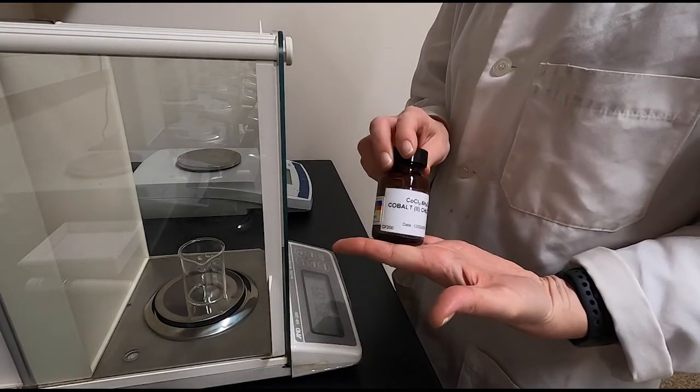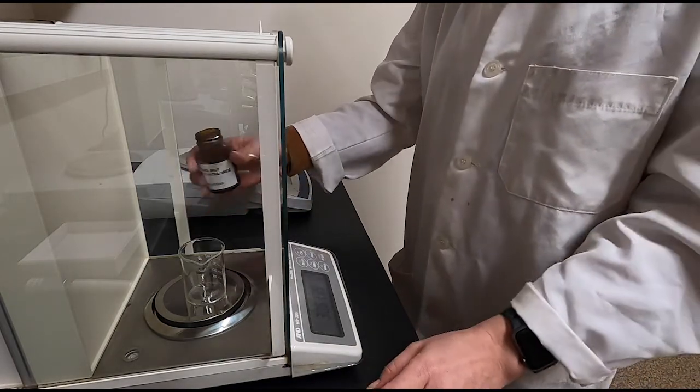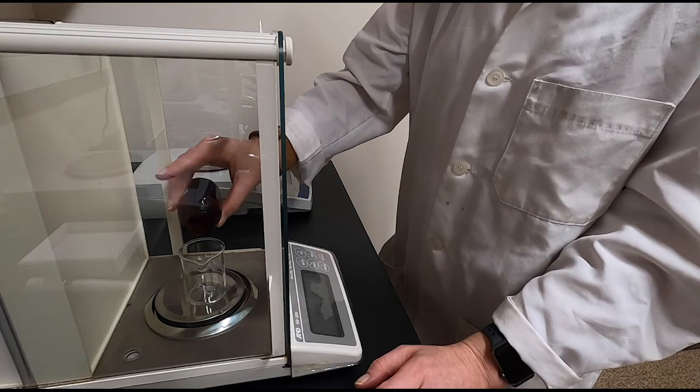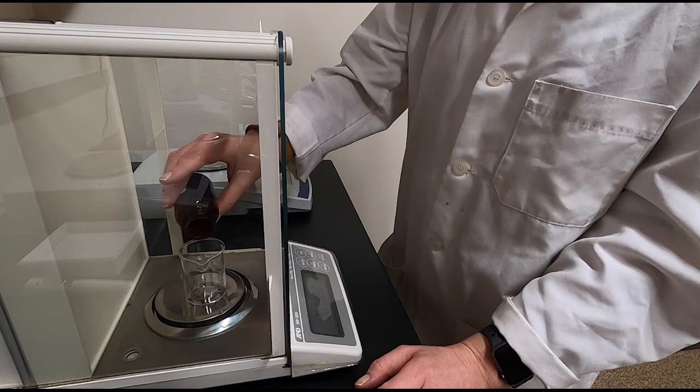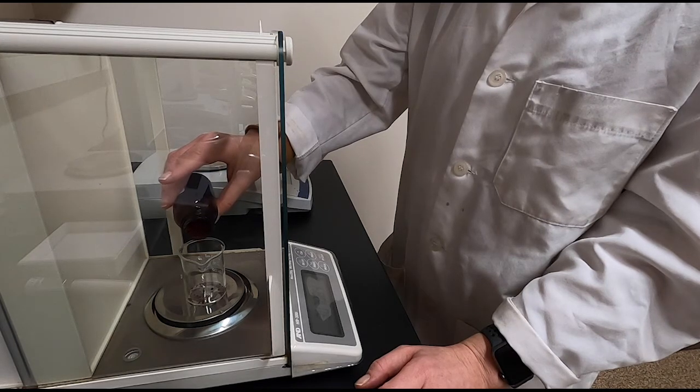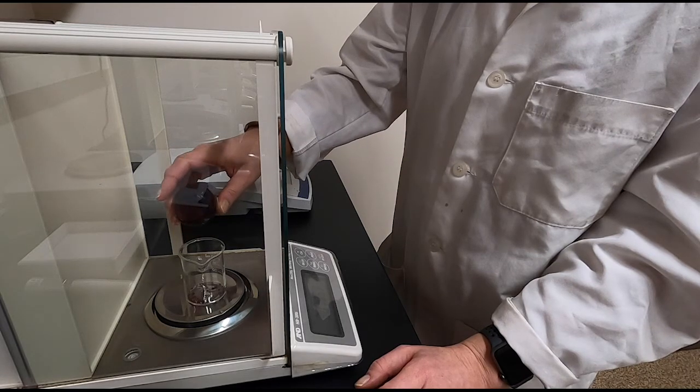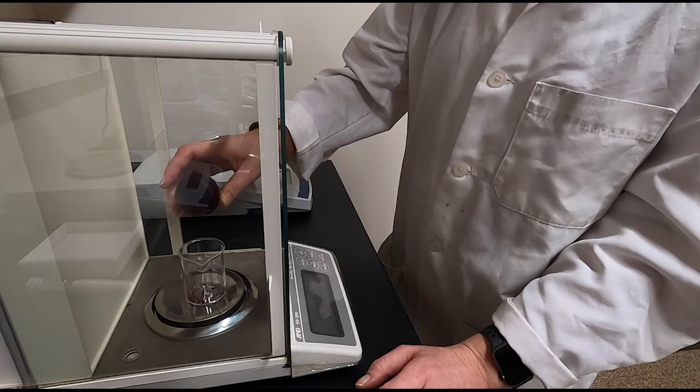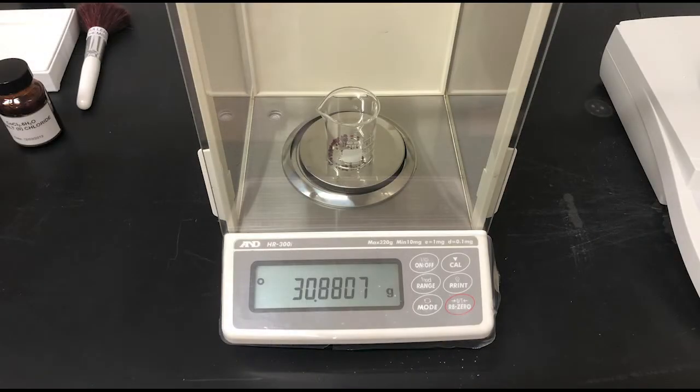Now I'm going to weigh out between 0.25 and 0.3 grams of the cobalt-2 chloride hexahydrate. We're weighing by difference this time, so you want to write down the mass of the beaker plus the solid so that you can find the mass of the solid.